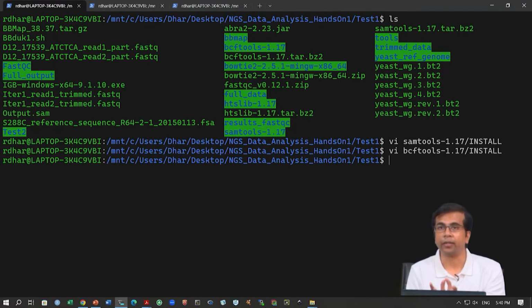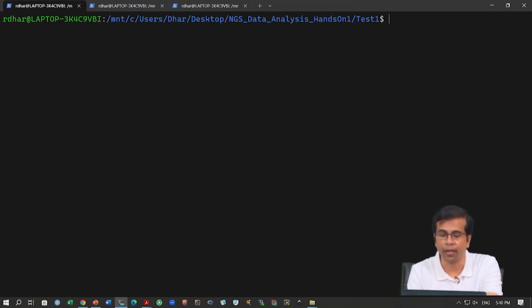There could be some errors, you probably will notice. This is something that might happen, and again there are workarounds for those problems. If it is simply some library missing, you can install those yourselves. Now we can move into the analysis part itself, after we have done the installation. The first step of the analysis is the conversion of the SAM file to the BAM file.